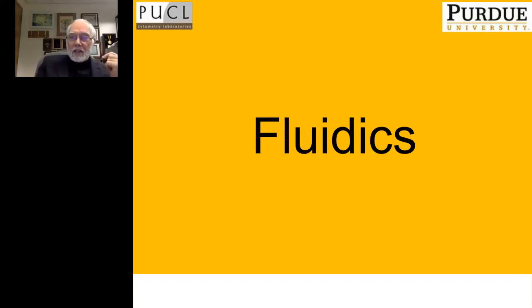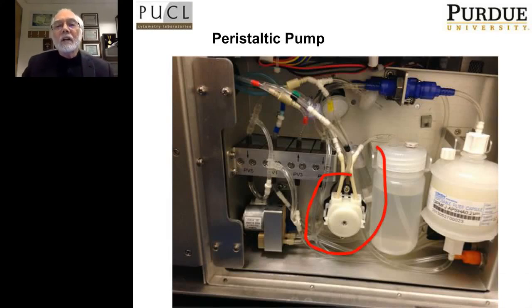So I've discussed the fundamental differences in detectors, the fundamental differences in the optical system, and now I want to talk a little bit about the differences that this system has in fluidics. So it's really not complicated at all. It again may well be one of the simplest fluidic systems that I've seen. There are a couple of flow cytometers that have extremely simple fluidic systems, and the CytoFLEX is definitely one of them.